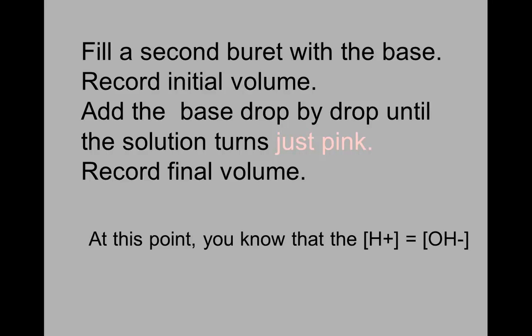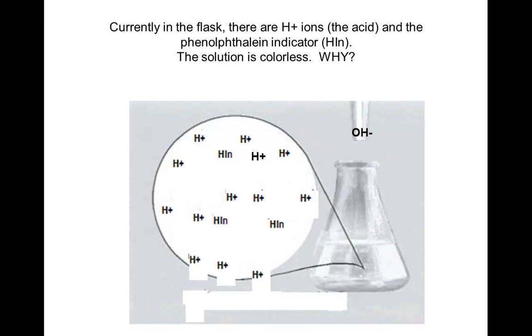Now when we hit that hint of pink color, we know that we are exactly at that point where the molarity or the concentration of our hydrogen ion is exactly equal to that of our hydroxide ion. Okay, we've reached that neutralization point. So what's actually really going on in there?